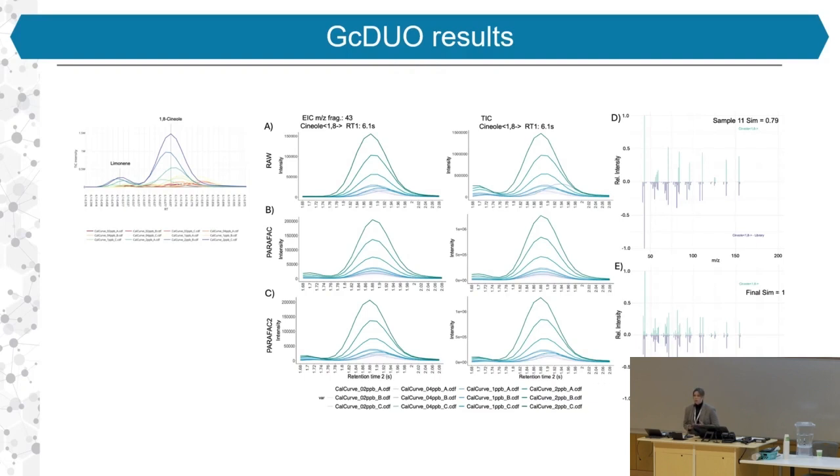Then we also check the differences between PARAFAC and PARAFAC2. The additional information provided to the model enables precise results. Although both of them are similar, we see that PARAFAC forces the alignment of the peaks, which might cause an over or underestimation of some areas that we are obtaining. If we are using PARAFAC2, the original data is maintained, preserving the area of the compounds.